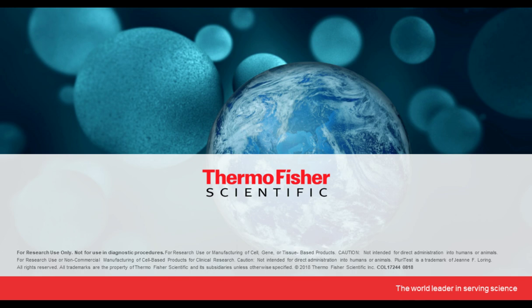Dr. Hexom, our first question is, KaryoStat versus KaryoStat HD. When do I use which one?